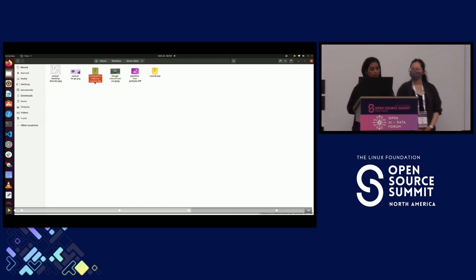And you can see once the model is trained, we collected all the data set from Kaggle and just trained the model, got everything downloaded as a zipped folder, and then we just have it on our file system here. So that's the zip folder that you see. So how do you build an AI pipeline and integrate that into the solution?